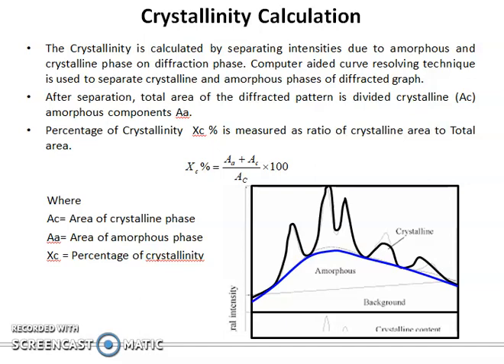Dear students, I have covered part 1 of X-ray diffraction in my previous lecture. Now I am starting in continuation of the previous lecture. Today I will discuss the crystallinity calculation through X-ray diffraction.